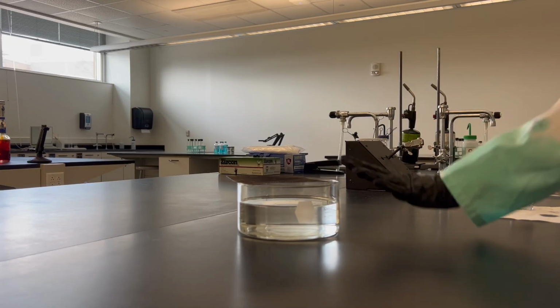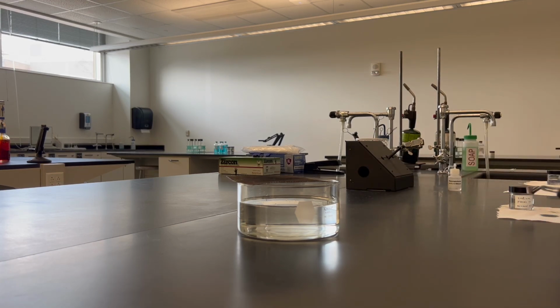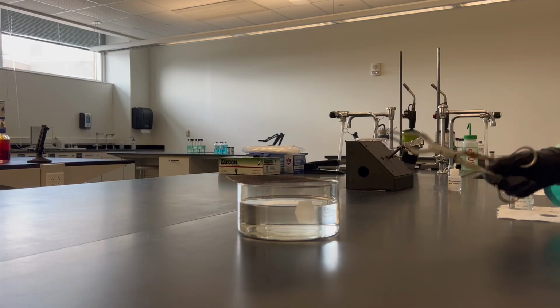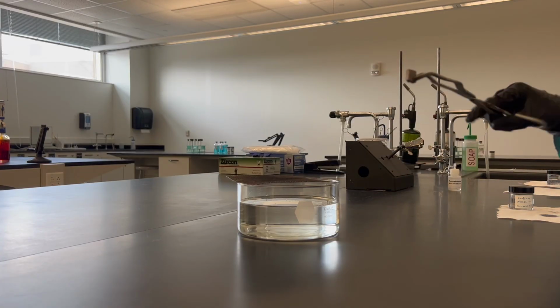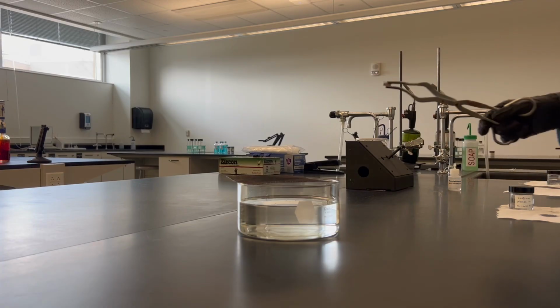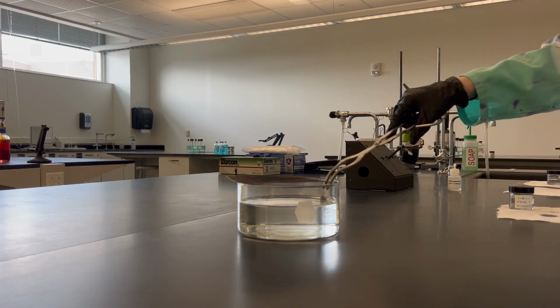Okay, so what I have here is a shallow beaker filled with deionized water, and I've also put some phenolphthalein in there so we can actually see the chemical change as it happens. Right here I have a piece of elemental or solid sodium. It's nice and shiny, lustrous because it's a metal. It's not as shiny as when I first cut it because it is oxidizing in the air. So I'm going to go ahead and put this right into my solution, and we're going to see what happens.